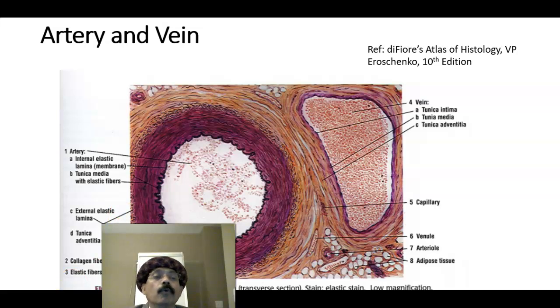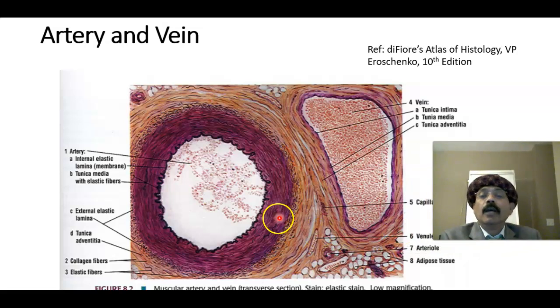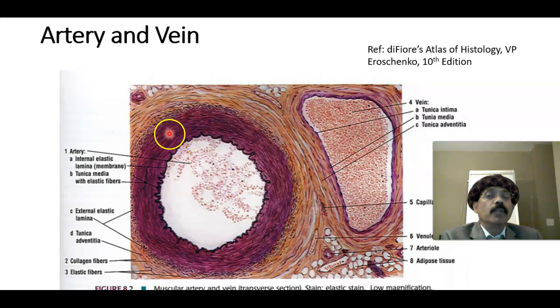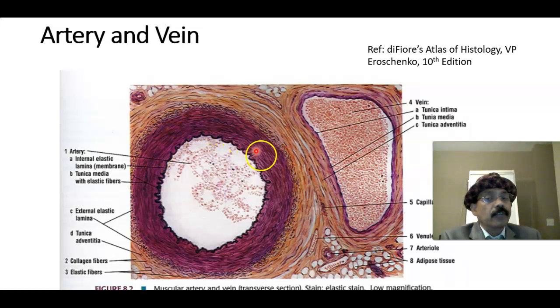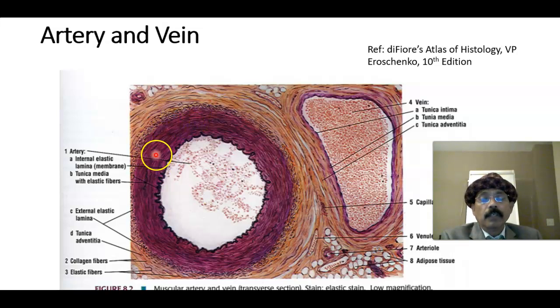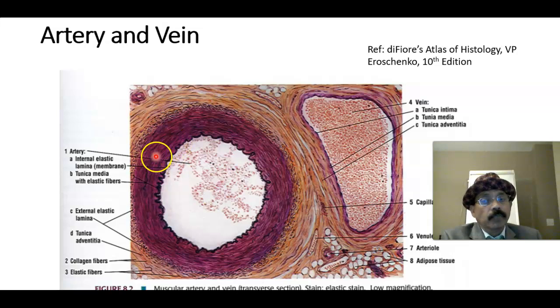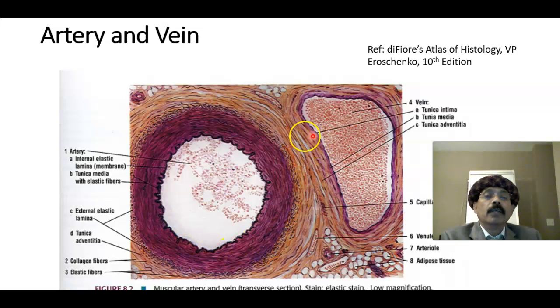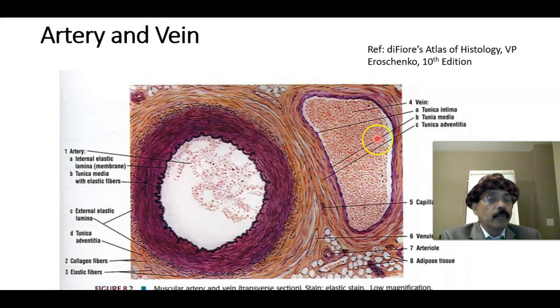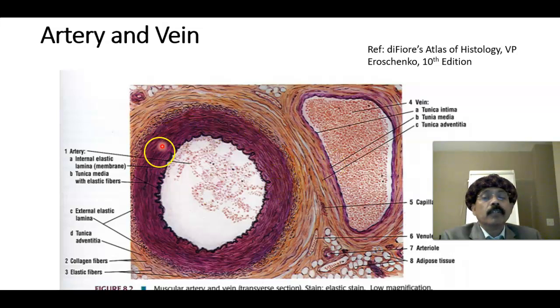Comparing a medium-sized artery with a vein: the artery has a very thick internal elastic lamina and the muscle layer may have up to 40 layers of smooth muscle interspersed with elastic fibers. These smooth muscles also produce chondroitin sulfate, type 3 collagen, and elastic fibers. In comparison, the vein's smooth muscle is very thin, and the lumen is collapsible — it may not be circular.